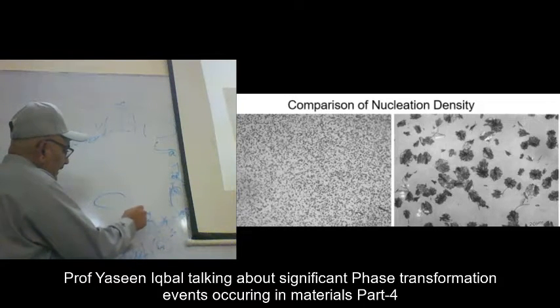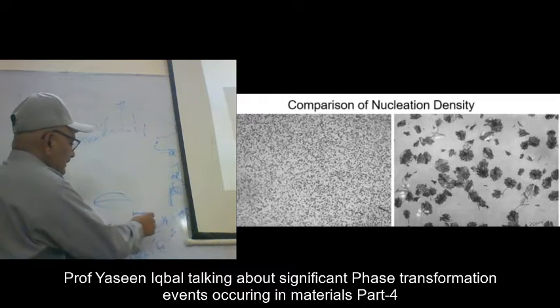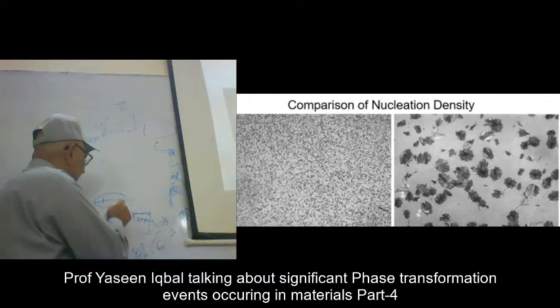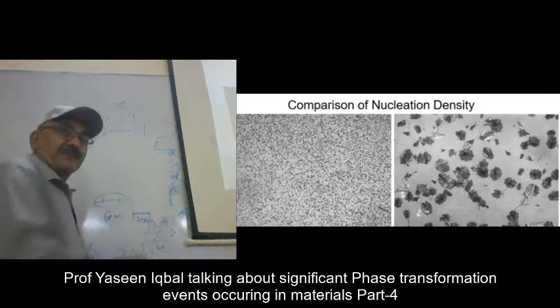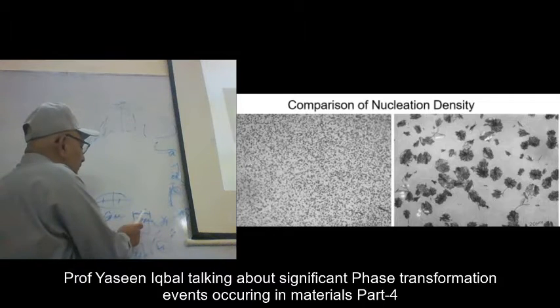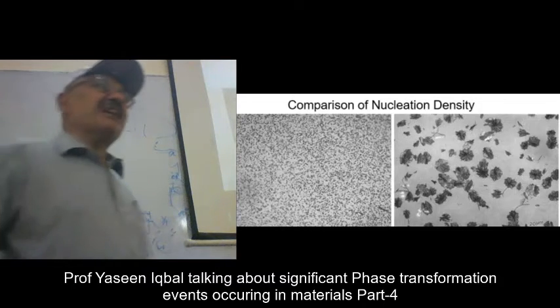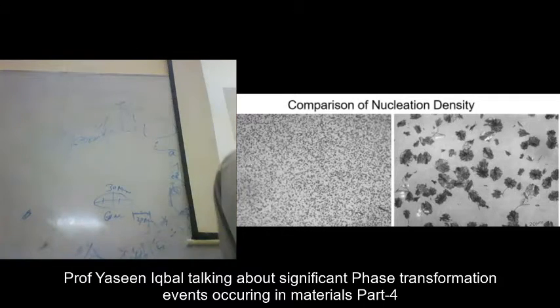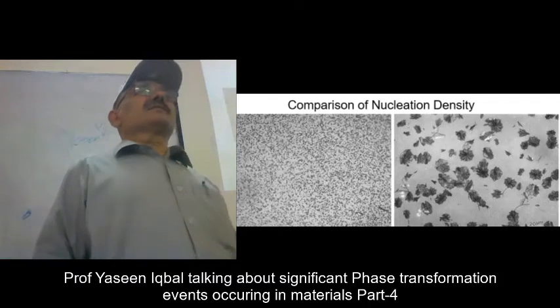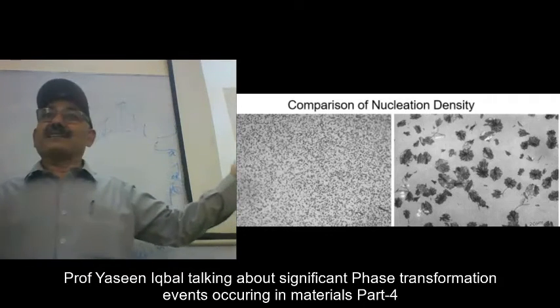So now I take how much is this? This is, for example, 1 centimeter and this is 3 centimeter. So the breadth of this crystal is 60 micrometer. Then look into this direction. It is, for example, 1.5 of this scale bar. 1.5 of this scale bar is 30 micrometers. So if you see the crystal dimensions, the crystals were about 1 micrometer. This is wrong. Crystal is not a thin needle. If you are talking of the length, then it's okay.